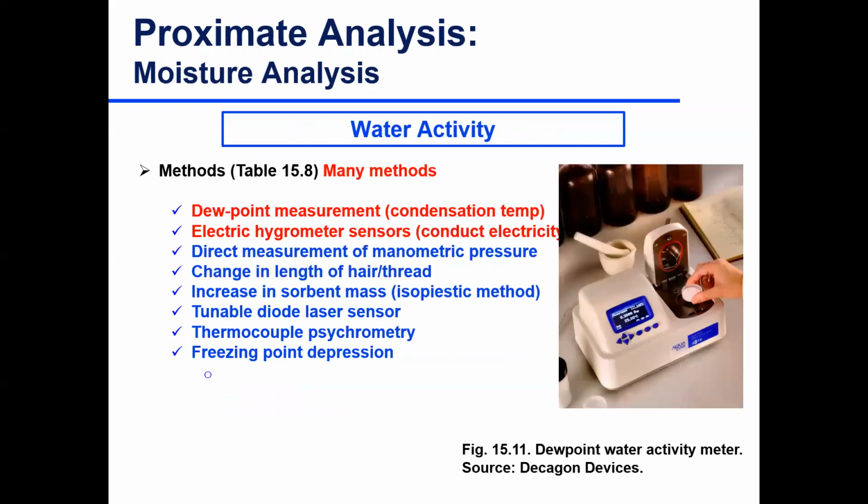And these are some examples. Basically, what you're going to do is measure the moisture in the headspace, the airspace above a sample. These are probably the two most common.